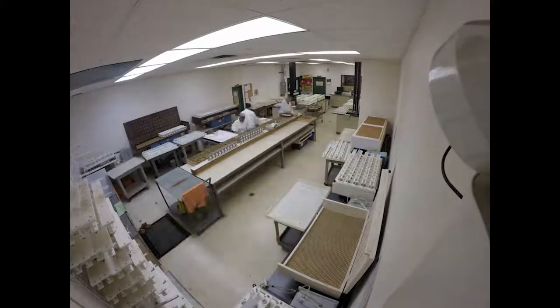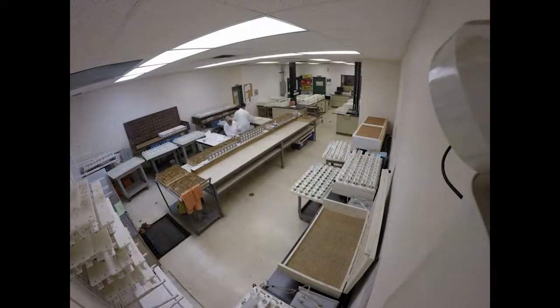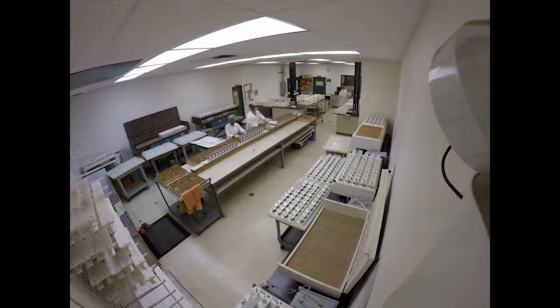The lab batch sheet is a list of samples requiring a particular analysis. The batch sheet also contains quality control samples such as a blank, a spiked sample, and sample duplicates. The quality control samples ensure that analysis is valid and measurements are correct.